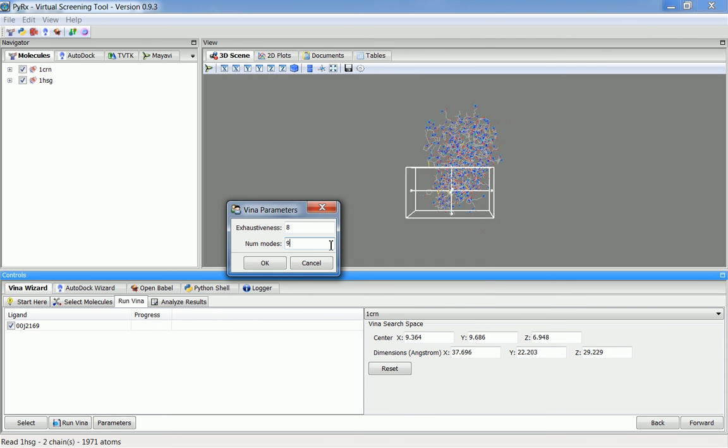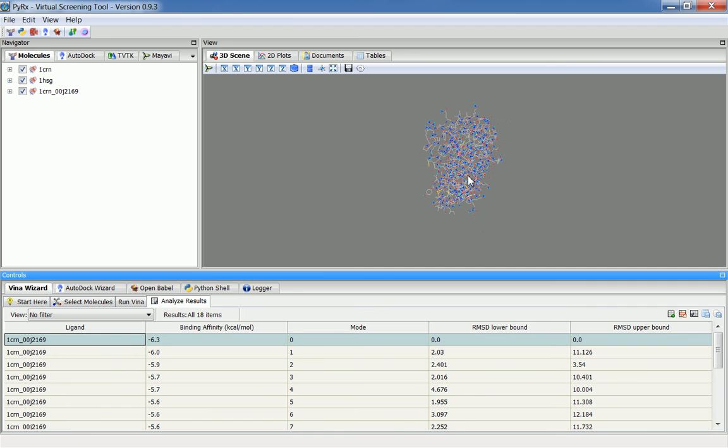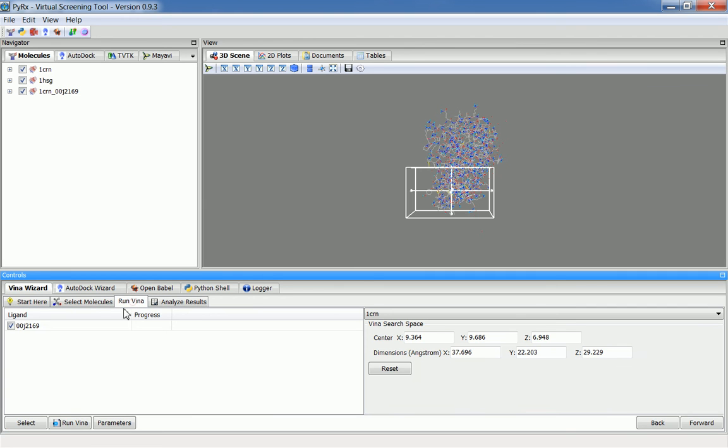This lets you choose fewer modes to work with. When I click Forward, again, since I've already run this, it will show me pre-computed results. If this is the first time you're running, it will run this ligand against this receptor, then this ligand against this macromolecule.